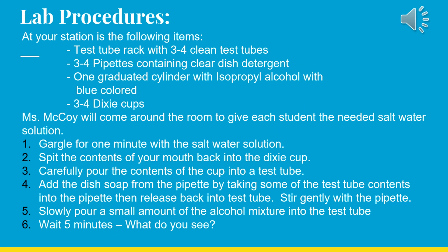Lab procedures. At your station are the following items: a test tube rack with 3 to 4 clean test tubes, 3 to 4 pipettes containing clear dish detergent, 1 graduated cylinder with isopropyl alcohol with blue color, and 3 to 4 Dixie cups. The teacher will come around the room to give each student the needed saltwater solution.